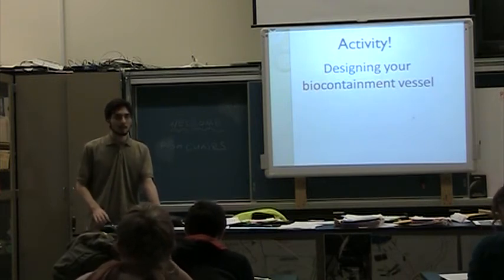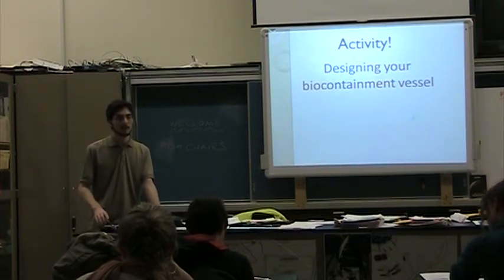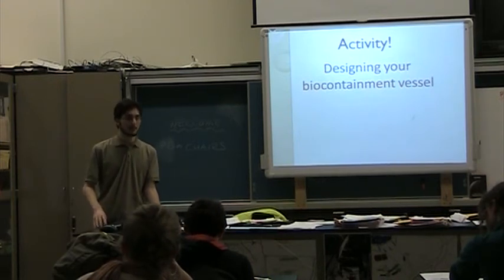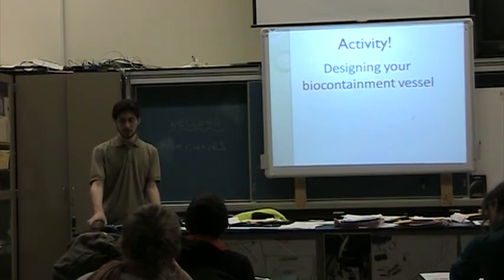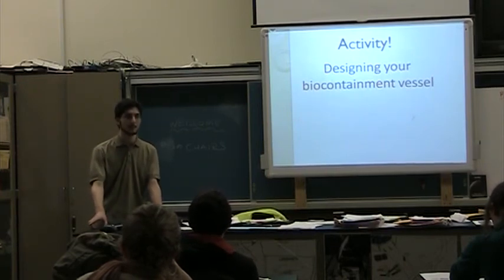So in this, we're having a hypothetical category B substance in liquid form that I want everyone to draw a picture of, just a containment vessel of some kind. I won't tell you what it is because that's kind of up to you to consider.